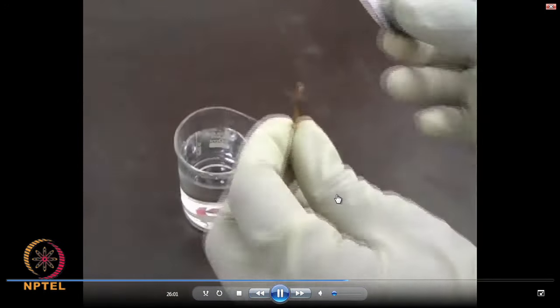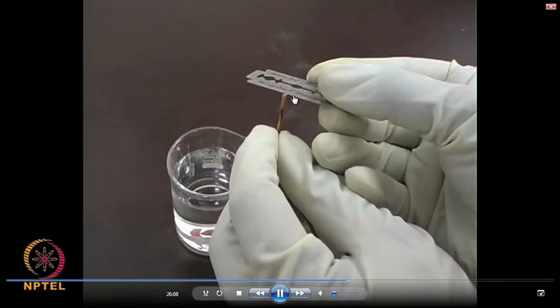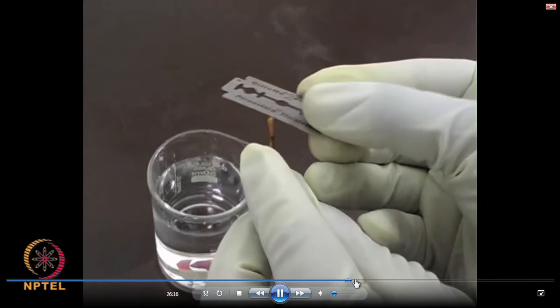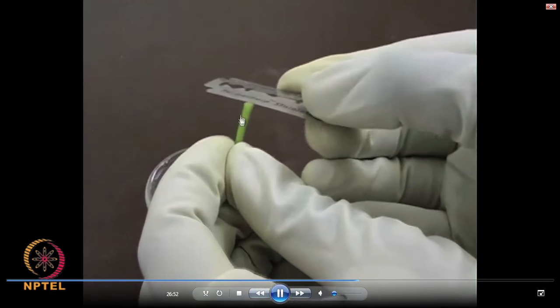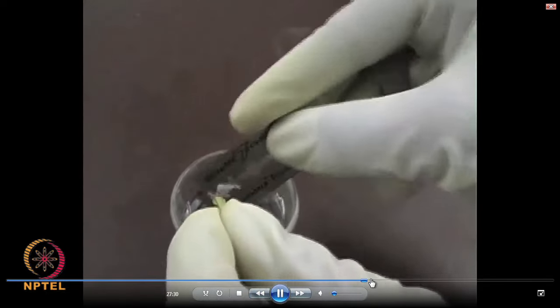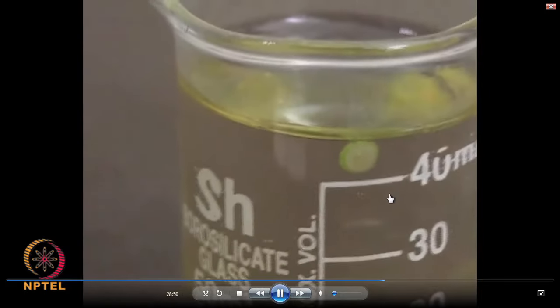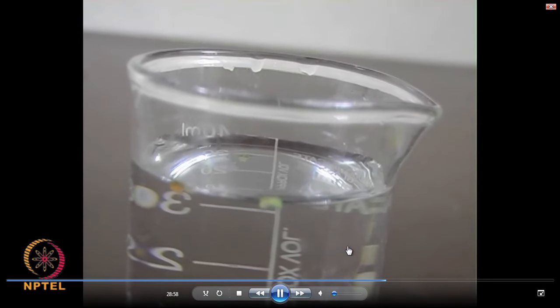You just take the stem, and it is sliced by the razor blade to the smallest possible thickness, and then you are supposed to put it in floating water in the beaker. Let me speed up this activity. This is done for the money plant stem now. Earlier one was the banyan tree root, and once you make slices and collect them in the beaker, you have to choose only very thin and transparent samples for the examination. The one which is floating in the water is most suitable and good for microscopic analysis.